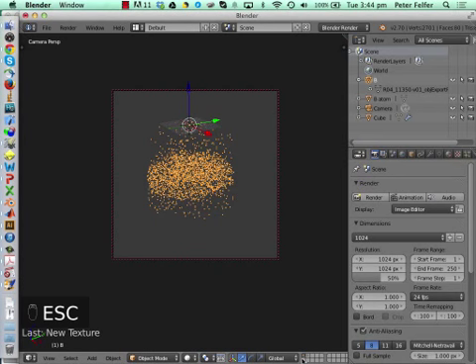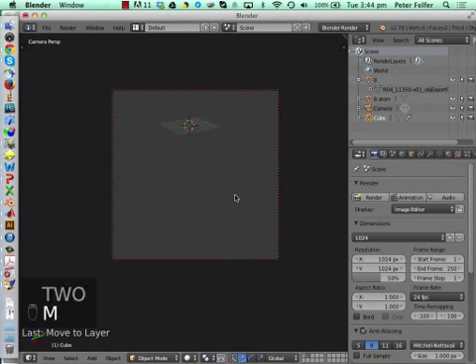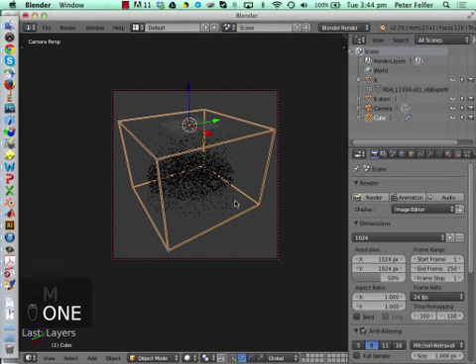And now, export as a SVG or vector graphic. You can't render a vector graphic in a traditional sense because that's not what rendering is. Rendering means you're calculating pixels. But Freestyle from the next version on will actually have SVG export. So you remember we had Freestyle before, we had the solid lines and the dashed lines.